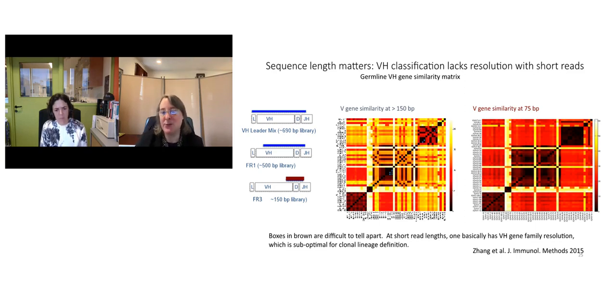And we use that as part of our clonal definition. So we say, okay, clones are related, and Encarnita described for you the CDR3 sequence as this important fingerprint, but we also group sequences together based on sharing the same V, usually the same J, the same CDR3 length, and very similar CDR3 amino acid sequence is usually how people do it. So part of that clonal grouping requires a V gene assignment to be accurate.